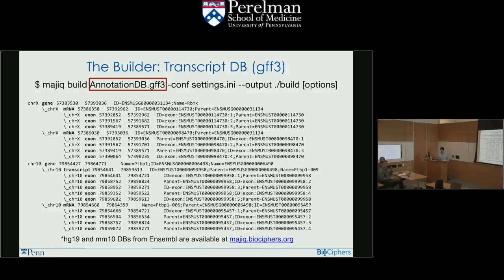What about circular RNAs? So we don't focus on circular RNAs right now. It was in the list of things we said we're not doing. But what I mean is, if I have a circular RNA, could the algorithm of VOILA analyze it? We've never tried it. I wouldn't expect it to work because most of them are back splicing reactions, right? So you have a read that starts downstream and then splices to upstream. I don't think we formally tested it. I don't know if Jordi knows that it'll definitely fail.